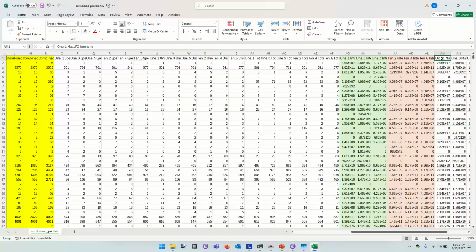Let's talk about the zero for a moment. What does it mean to say there's a zero value for the intensity of a protein in a given replicate? Missing value? Missing value. Okay. Does this mean that no intensity was seen for any peptide for this protein? I think it means either the protein doesn't exist or it couldn't detect it. It could also mean that there's not enough information to conclude that that protein is present, but there could have been peptides from it.